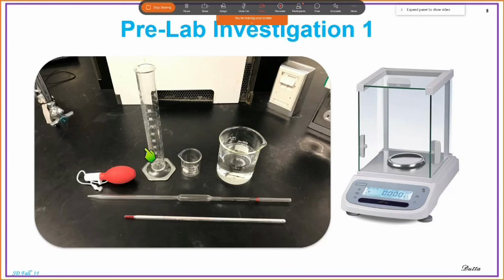So we simplified this one. Instead of 4, we are going to give you 3. Now keep in mind, this is just to keep the water. You'll be using a beaker, graduated cylinder, and a pipette. And of course, you have to use a thermometer to know the temperature of the water. So when you first go to the lab, you'll see these are already there at your workstation. The only thing you have to do is take the beaker and grab some water.